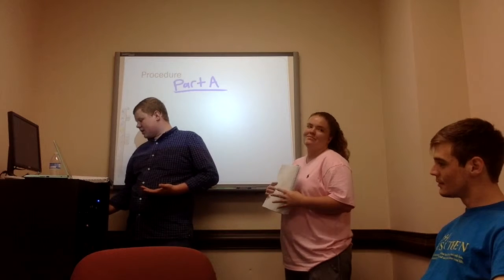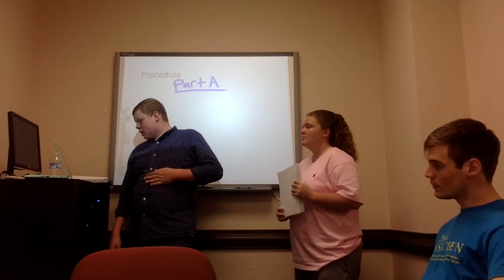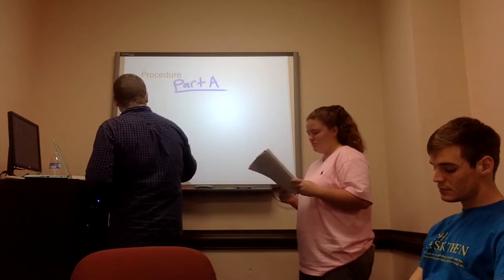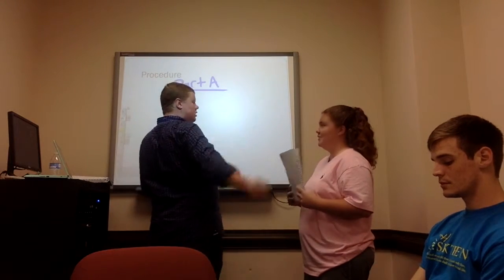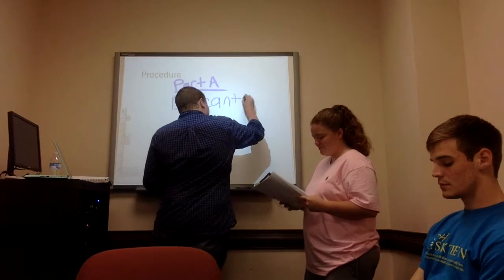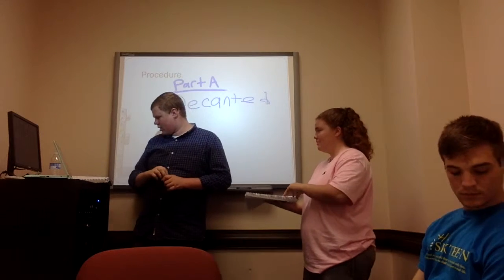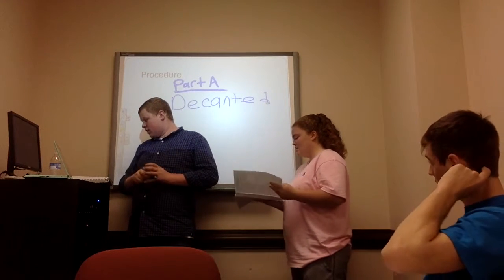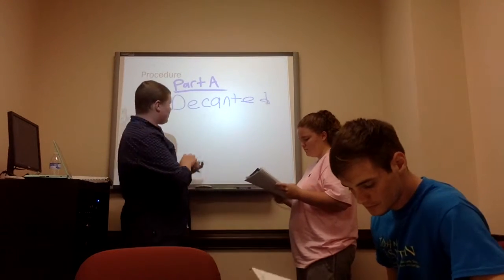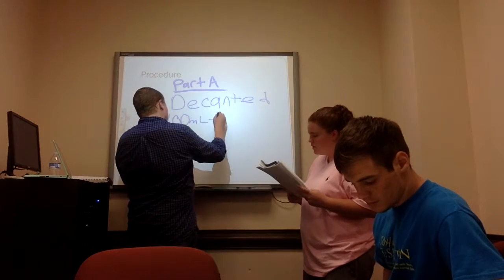It should have contained an aqueous zinc, iodine, and acetic acid solution. So, what did you do to that solution? You decanted it. And how did that go? Did that go pretty good? Yeah. So you decanted the solution to a clean, dry 100 milliliter beaker, I'm assuming, right? Yes. What was the mass of that 100 milliliter beaker?